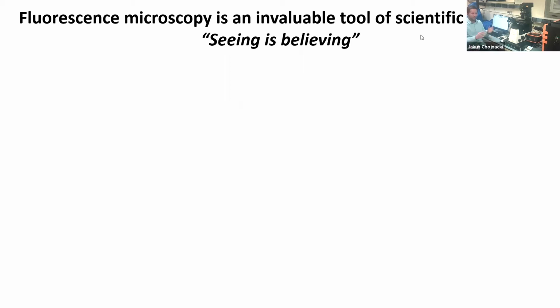So when you observe something directly through the ocular, it makes it a little bit more real. Because a lot of science, of course, relies on indirect readouts, where you get a lot of numbers, a lot of graphs, and those are not as directly informative as actually seeing something with your own two eyes. So as a scientific tool, it's very, very important.